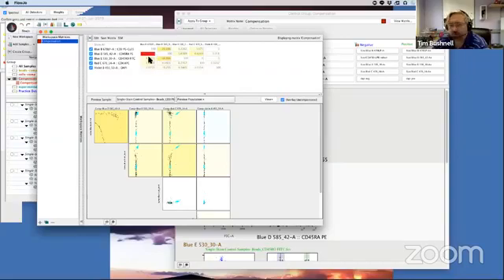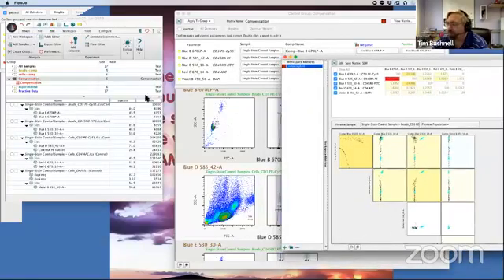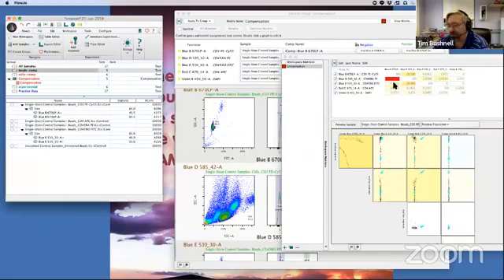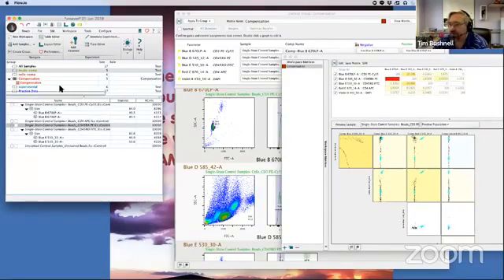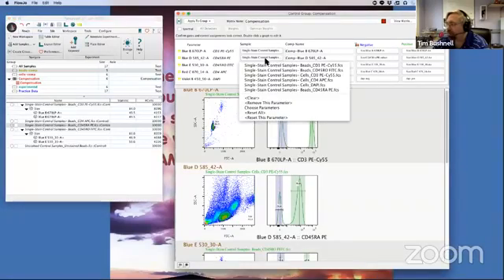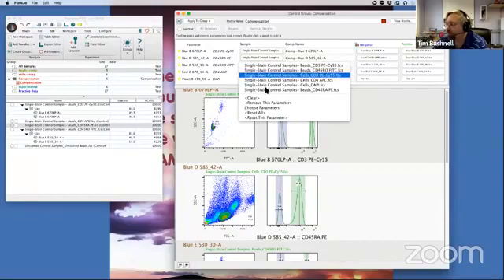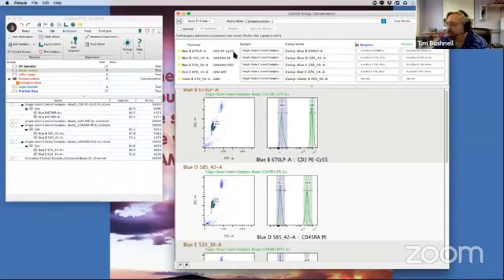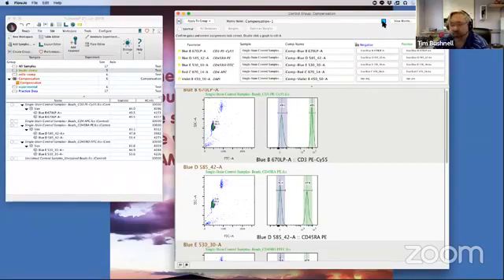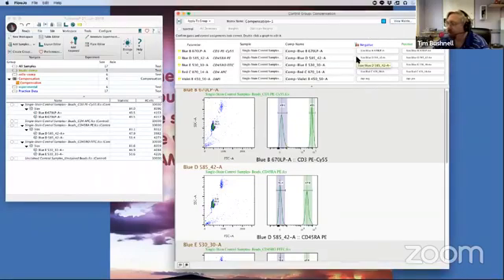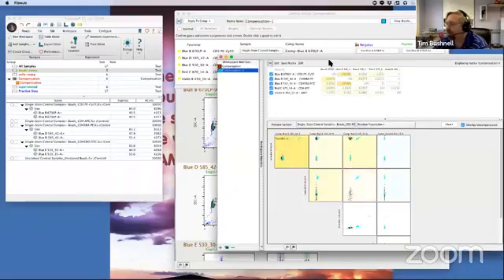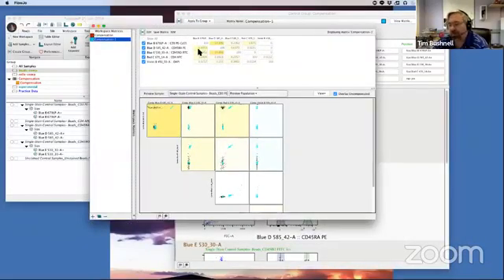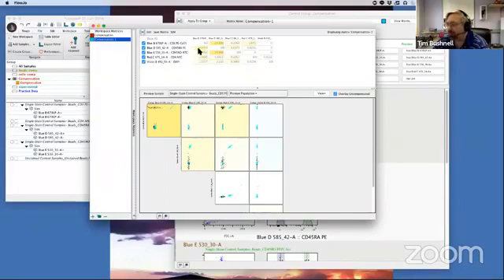So let's take a look at this back here. And we're saying it's in the PE. So we do have what I would say is a normal amount of detection in there. I'm just not sure where the problem is coming from. So this is a good case where, you know, if we go back and we're going to change this, we're going to come in here and we're going to grab our bead control. And I'll be honest with you, this is the first time I've ever seen this error with the data set. So I'm not quite sure what the problem is. So I'm going to put this in here to our compensation. I'm going to change this to 45 beads. We're going to now view our matrix. You'll notice now it's changed color. This is a new matrix. I'm going to view this matrix. There we go. That's what we'd expect. It's always good to know kind of the ranges that you want. So we can see this is much more reasonable what we'd expect to see.